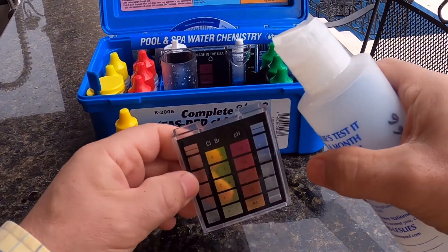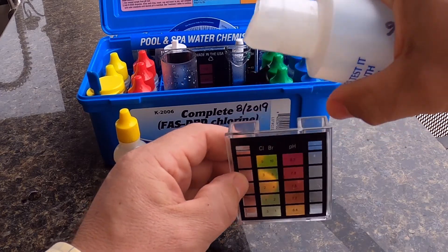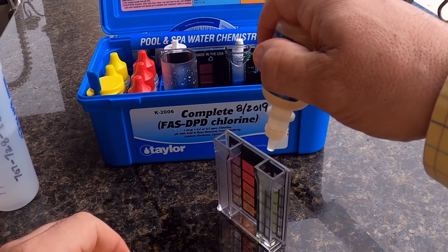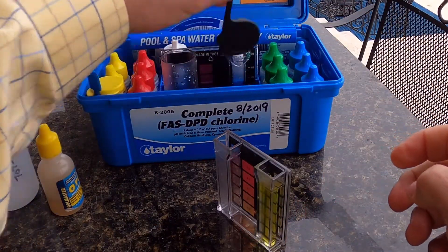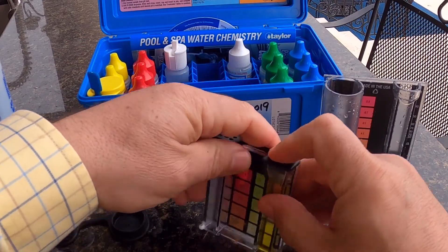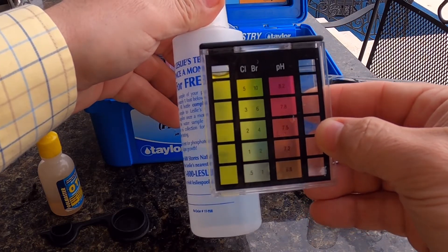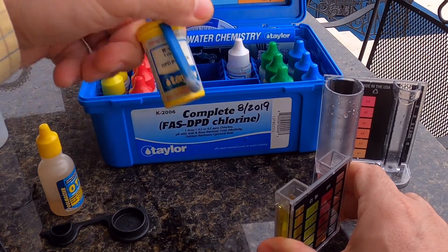Going to do another chlorine test, this time with the old school reagent. This is an old one I've had for a long time. Five drops of the OTO — I don't even know how valid this stuff is because it's pretty old. But we'll see if it gets a high reading like my Taylor test kit did. It looks pretty dark already, showing at least four or five. That ties out with the Taylor test kit, which read four.